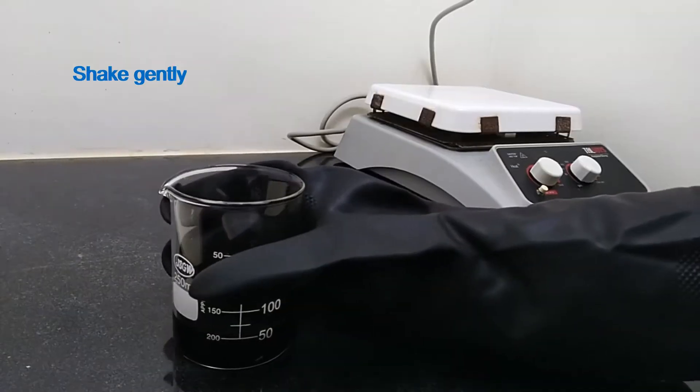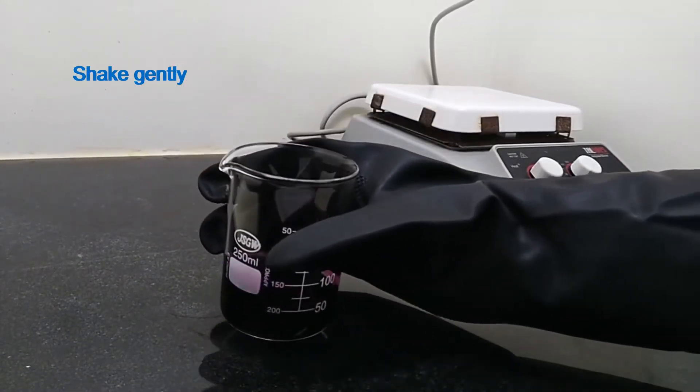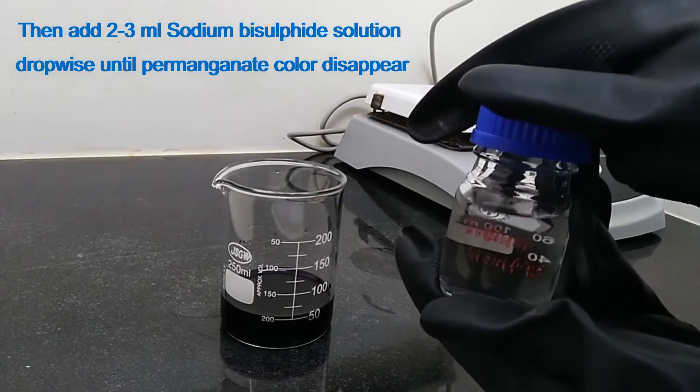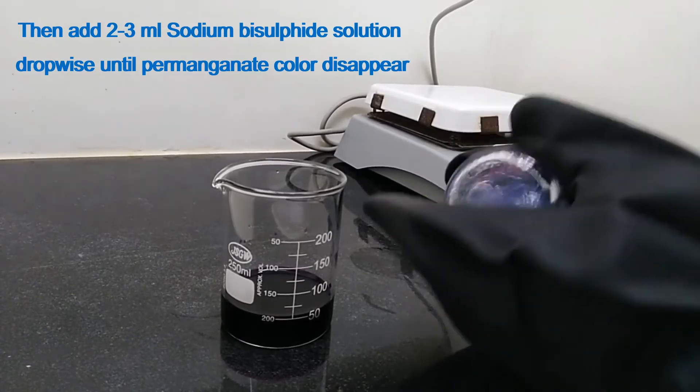Shake gently. Then add 2 to 3 ml sodium bisulfite solution dropwise until the permanganate color disappears.